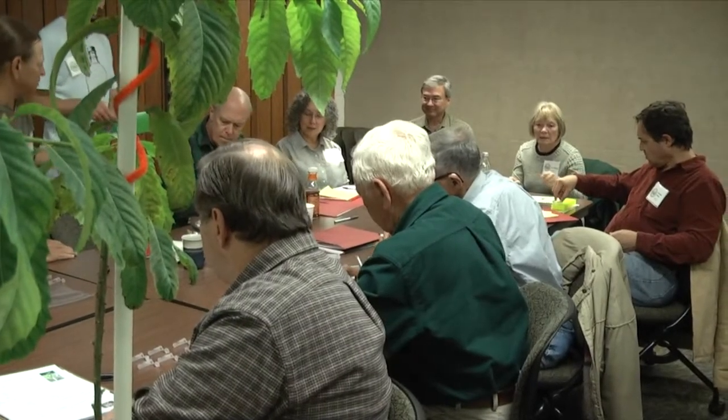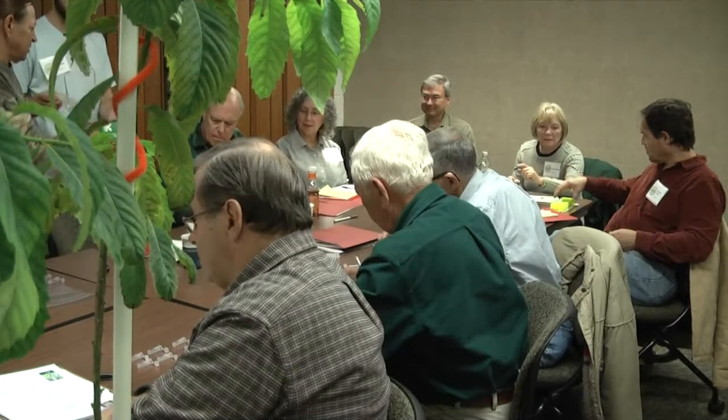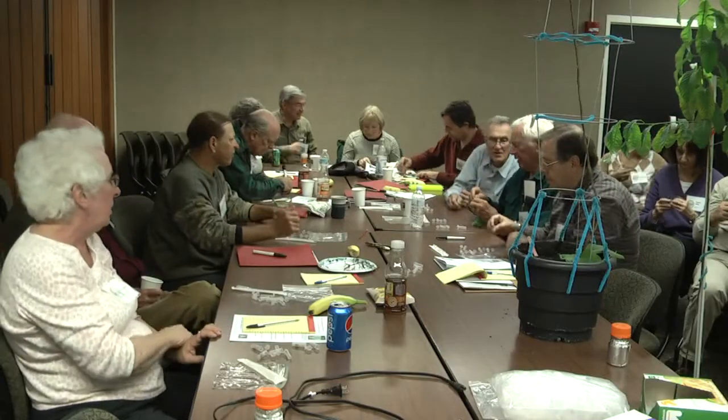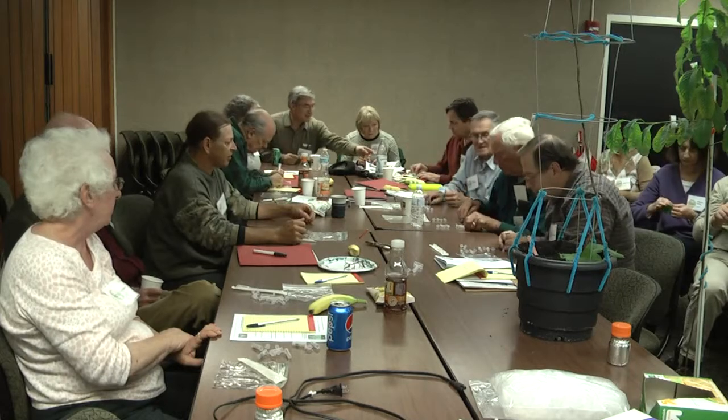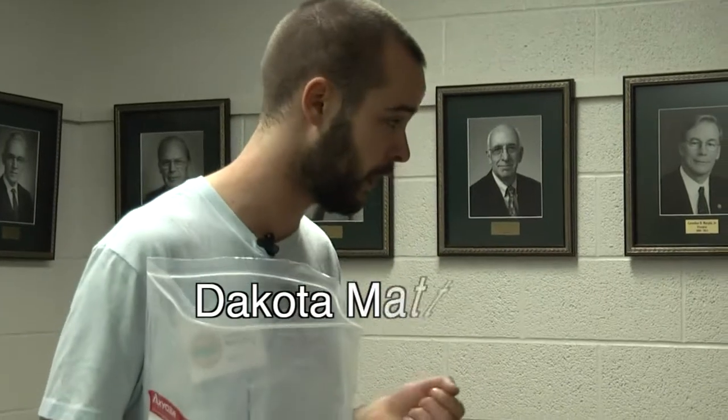The purpose of this test is for anyone who is at home who wants to plant American chestnut trees and have them proliferate as opposed to die after 15 to 20 years, the ones that would not have the transgene. That's normally their lifespan. So you're going to need 6 tubes, 2 for this tree, 2 for this tree, and then 2 for your banana.